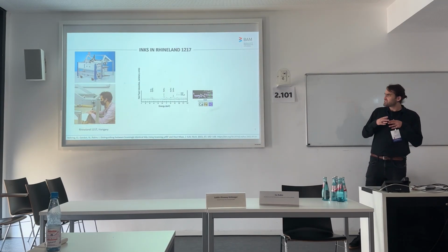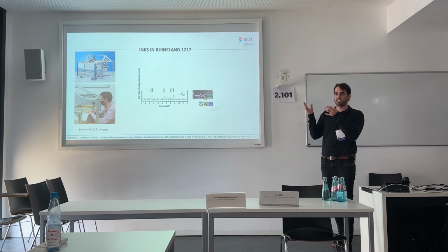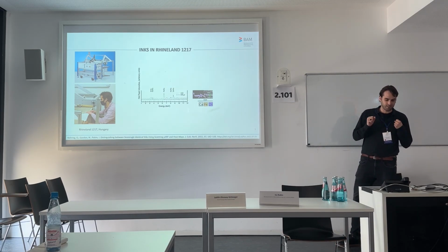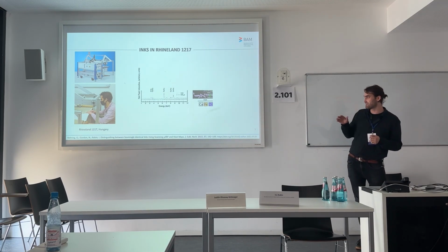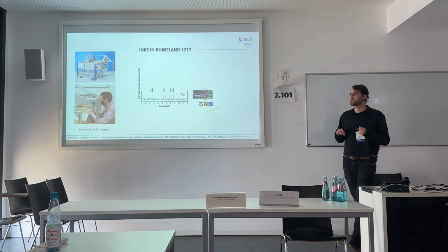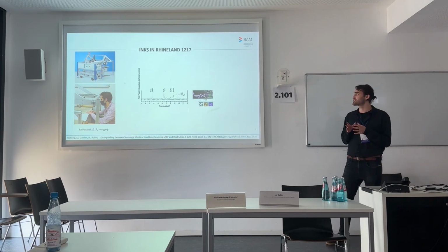However, this technique is also very helpful in studying inks which, as I showed in one of my previous slides, contain no significant vitriolic impurities which allow this kind of comparison. First, we look at the spectrum from not Elfus7, as it was in the previous case, but a scroll from a private Hungarian collection.